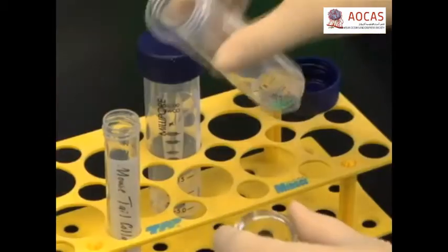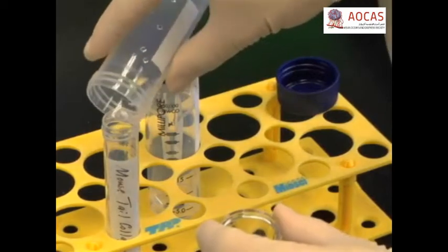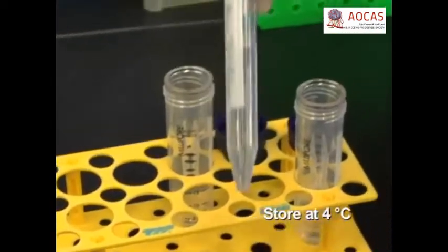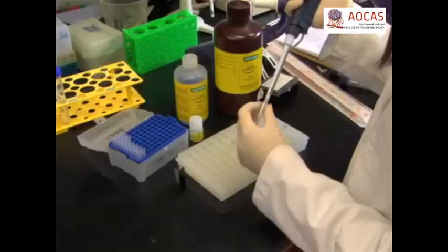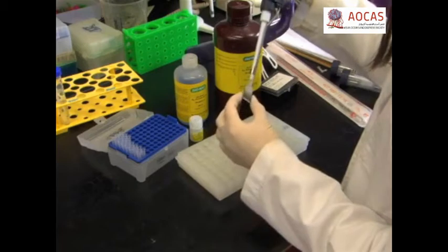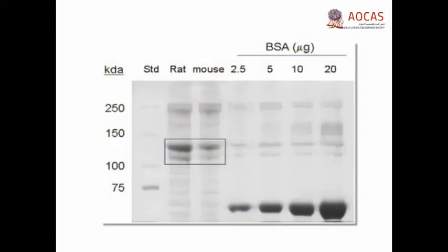Repeat the spin until the volume is reduced to 5 to 6 milliliters. Transfer the filtrate to a sterile conical tube and save at 4 degrees Celsius. Check the protein concentration using a standard Bradford assay. The purity of the extract can also be checked by resolving a sample on a 6% SDS polyacrylamide gel.